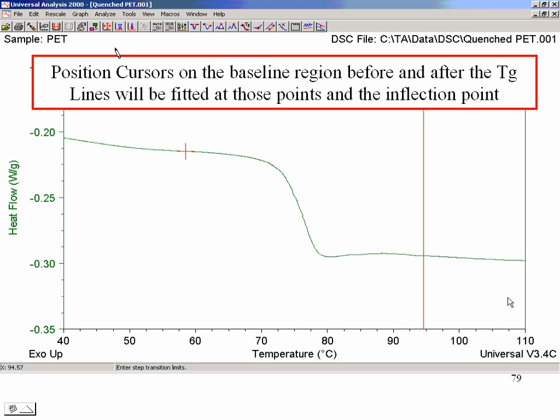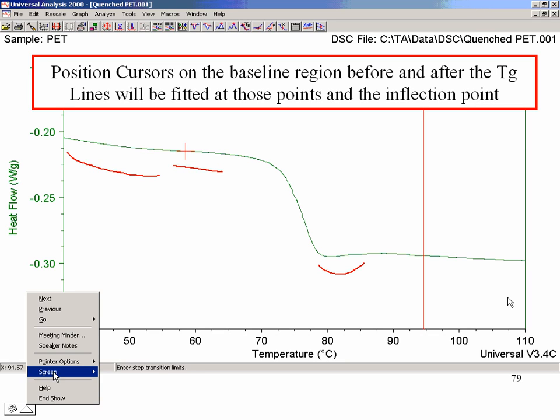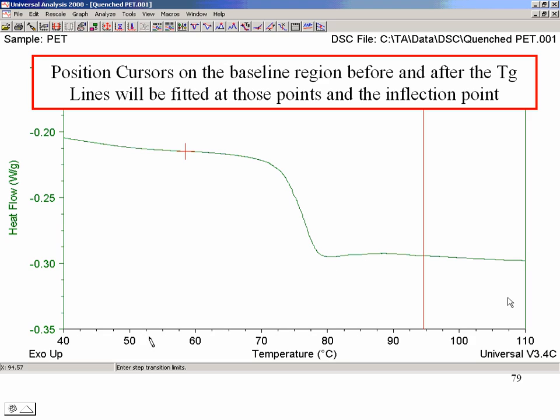Now, this is the kind of point I was trying to make here, that before, at the higher scaling, you really couldn't see the fact that there was a little bit of slope going on here, then it flattened out a bit here, and you didn't really see that there was this thing going on over here. So that's not obvious unless you blow the scaling up.